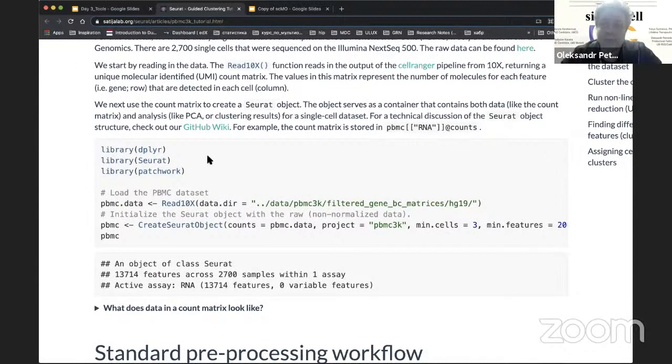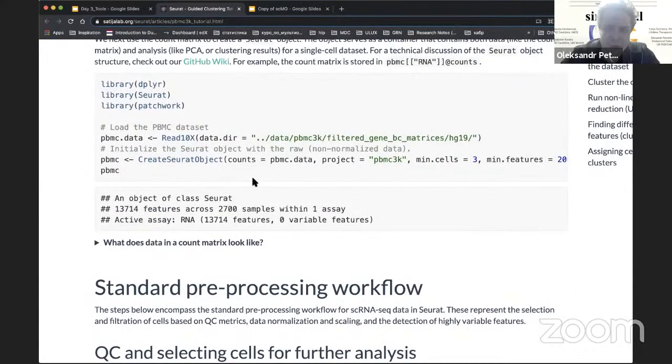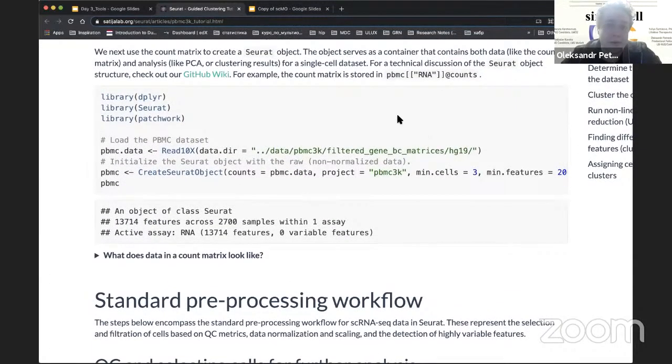So Alexander, what do you start with in single cell analysis? In the beginning, I asked the bioinformaticians from the facility if they could provide me the sample they sequenced. So then we can imagine we actually received it, and there are two options. Either they provide the very raw data file, which we still need to process a little bit before we start with Seurat, or the second option, they actually provide us the data files which are required for Seurat. So the first data file would be the matrix, which Marina mentioned before.